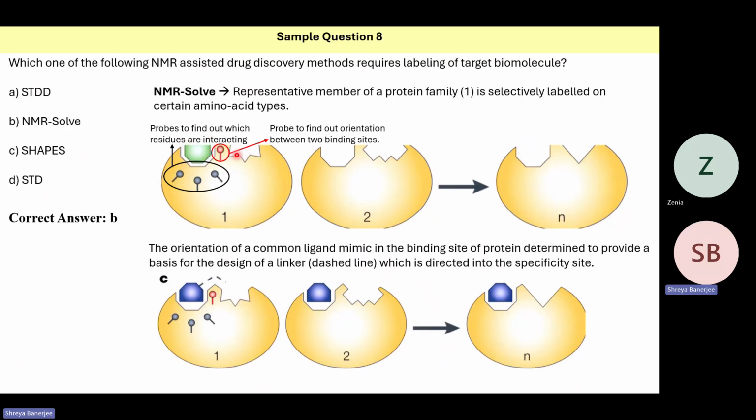And we also have to attach a probe to the region between two receptor sites to find out the orientation, in order to optimize the linker that will connect the ligands between neighboring receptor sites.